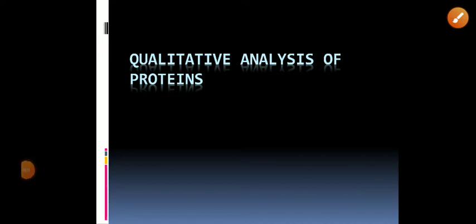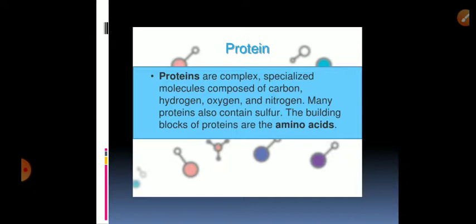Good afternoon, students. Today we are going to discuss qualitative analysis of proteins. Here we are going to study various tests that are used for identification of protein present in the sample.